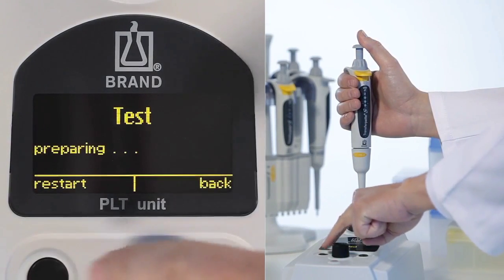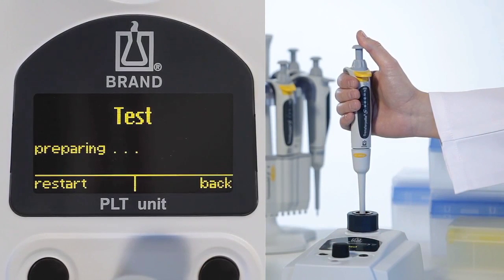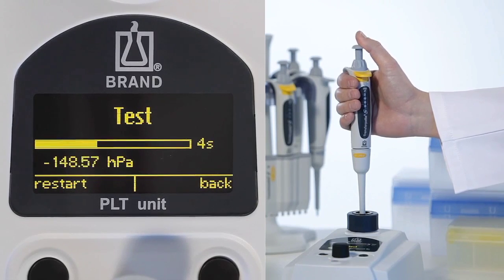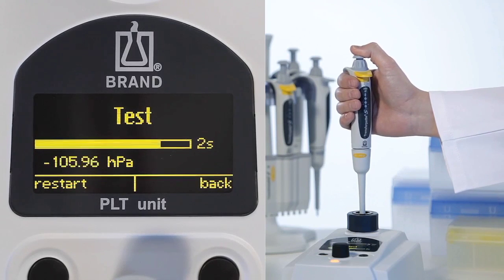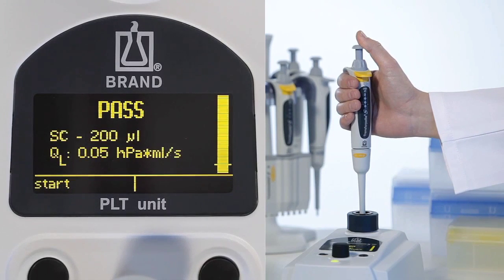We now check this pipette without the tip because the leak could be in the coupling area between the pipette shaft and the tip. The pipette is leak-tight. The tip is defective.